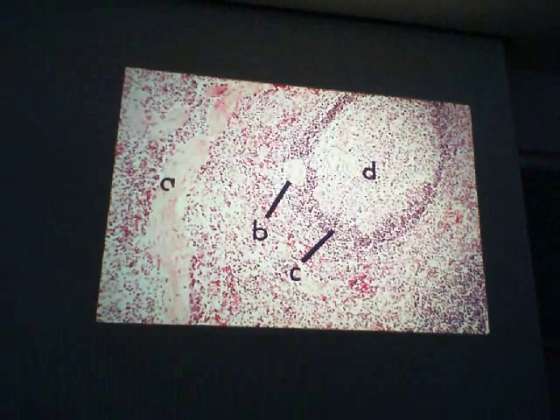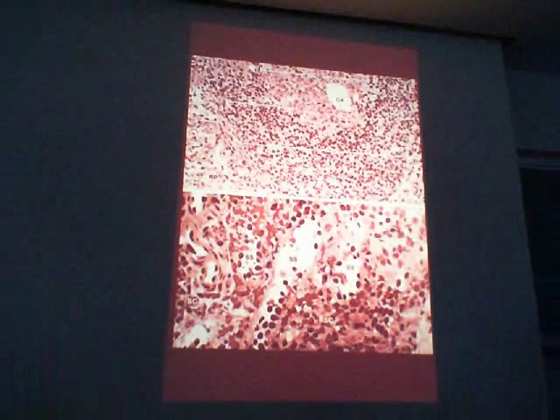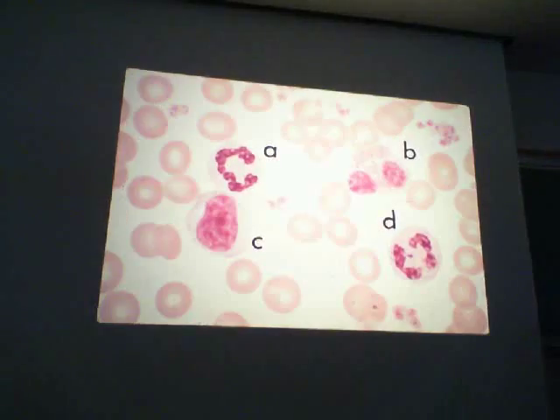And again, we've got another central artery right there. We've got a splenic nodule, nice germinal center. And if we go on to the next slide here, this is a plastic section, and there's one of those venous sinuses right there. And it's got those stave-like endothelial cells. And if we go on to the next slide, I think that's probably the last on the lymphatic system.